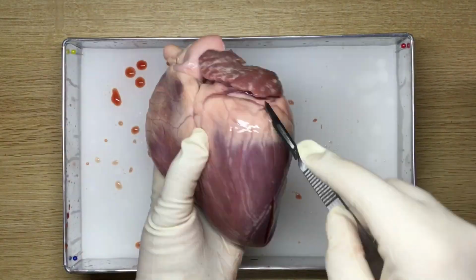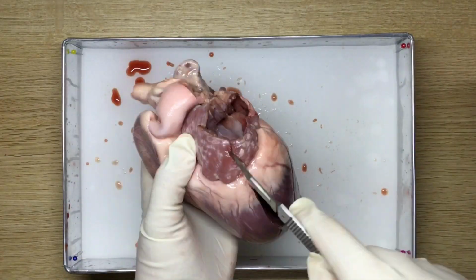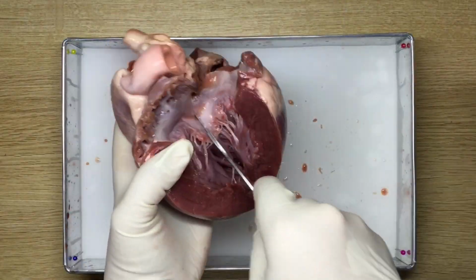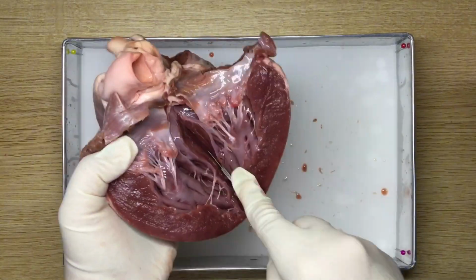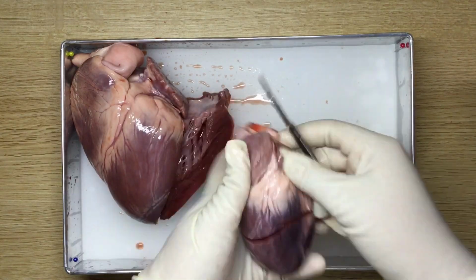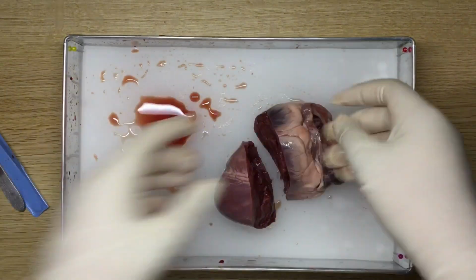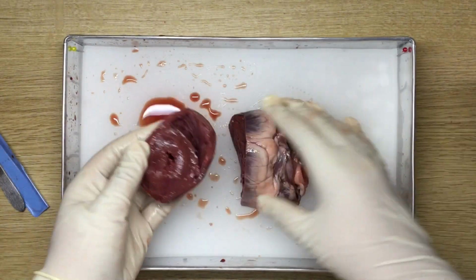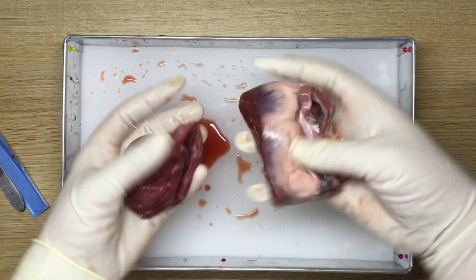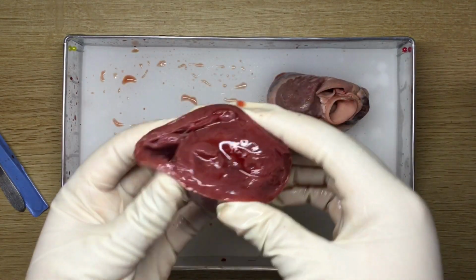We'll start by making a sagittal cut, dividing it into the right and left ventricles. Since we have 2 hearts, we'll also make a transverse cut, which separates the heart into the top and bottom sections. As you can see, there's a significant difference between the right and left ventricles. The right ventricle has a thinner muscle wall because it only pumps blood to the lungs, a shorter and lower pressure system.